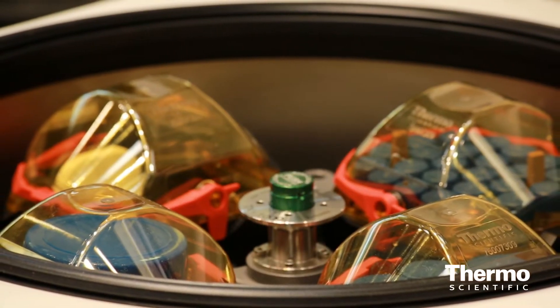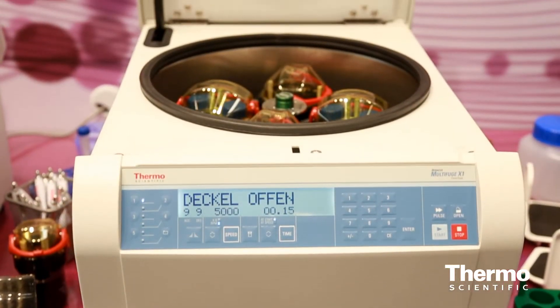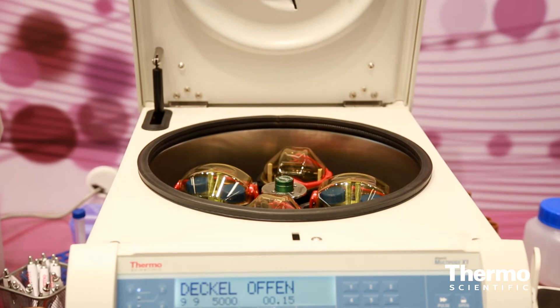It will also allow you to spin 40 50 mL conicals and up to 196 blood tubes, all in the same rotor. And there's more.